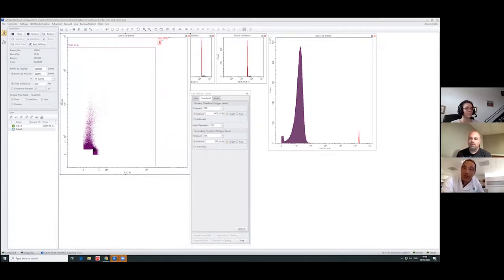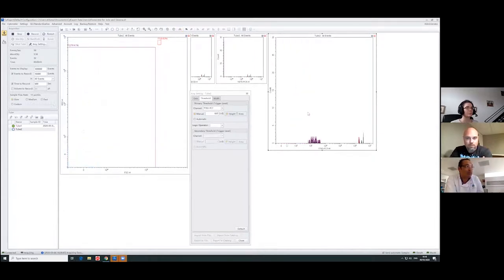We were talking as well about fluorescence, and this was a discussion point. Will you trigger based on your target? EVs, they have CD9 for sure. So we can put the labeling and focus just on your CD9 positive microvesicles or EVs. If they're positive and we label them with this one, we can place the threshold now on fluorescence. Now you can see the noise, you can see your beads, but also you can see your beads on the fluorescence. I can play as well with my fluorescence in here. So again, you can play with one or the other.